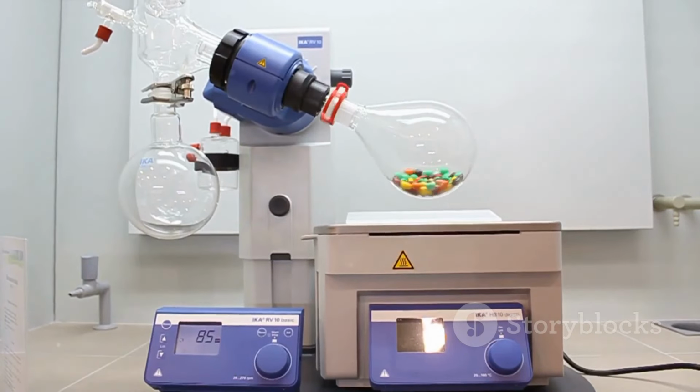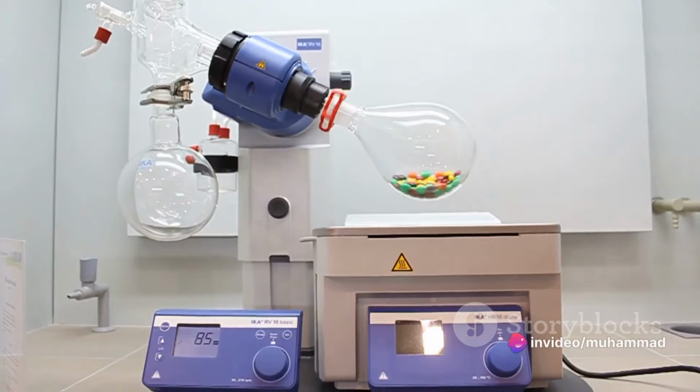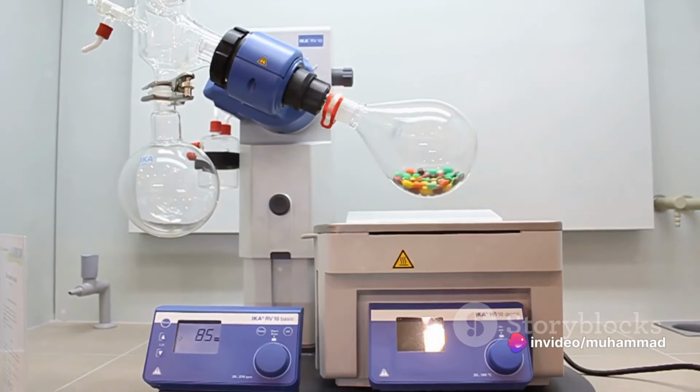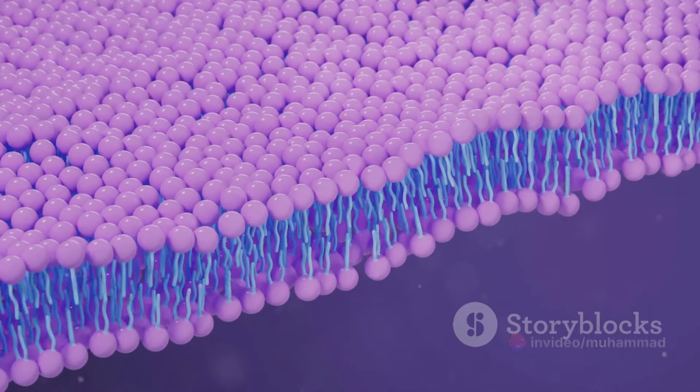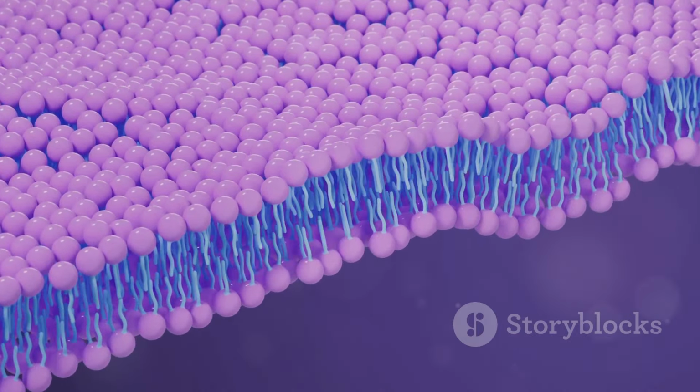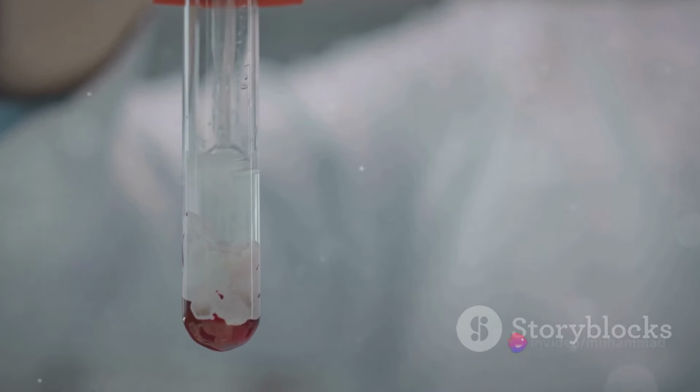Picture this: a scientist armed with a homogenizer, which is essentially a microscopic blender, disrupts the cells in a tissue. This action breaks the cell membranes, resulting in the release of the cell contents into a solution. This mixture is known as a homogenate, or a crude extract.